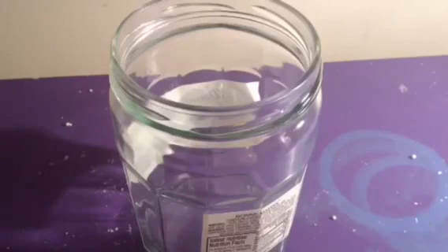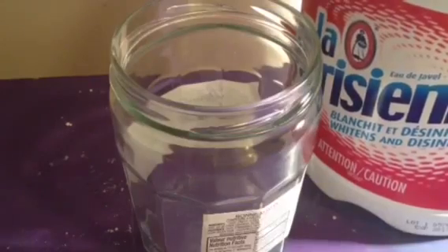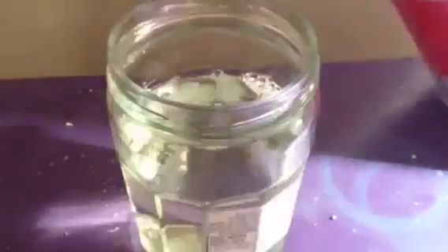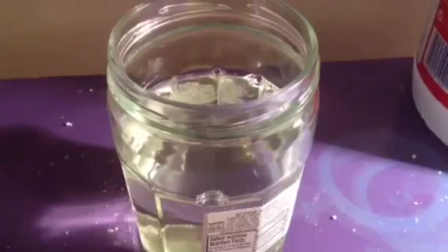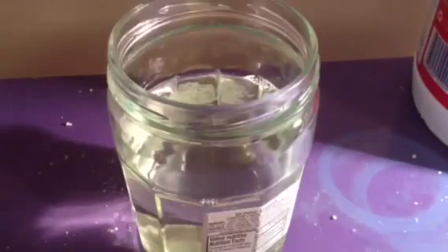Hey YouTube. Today I'm going to show you how to make chloroform. What you will need is bleach or sodium hypochloride and acetone. I'm going to start off by pouring some bleach into this jar, then I measured out my acetone, which I'll be adding in here.